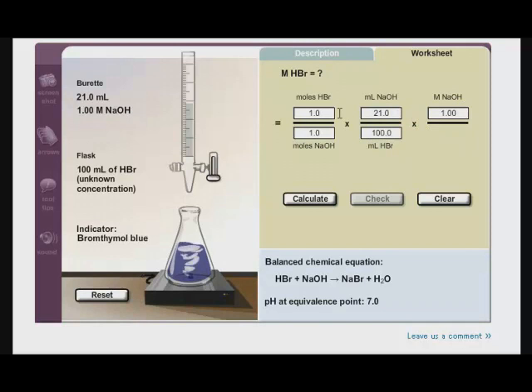So now that I've entered my values, I'm going to ask my gizmo to do the calculation. And it comes up with the concentration of my HBr solution as being 0.21 moles per liter or molarity. And I can go ahead and check this and see if I am correct. And it gives me the feedback.